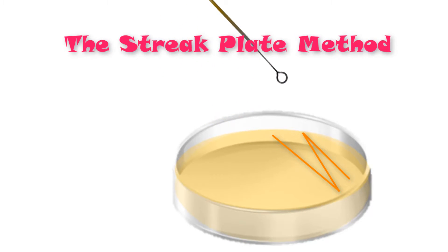With our agar plate, we can then use the streak plate method to dilute our sample enough to be able to grow individual colonies.